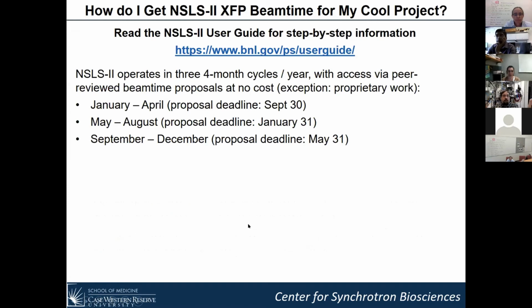I've said a little bit about the beam line. I'm going to say a little bit now about how you get access to beam time at NSLS2. I'm going to hit on some high points, but quite honestly, there's an NSLS2 user guide that's really well written and gives you step-by-step instructions on what to do. I have a link here, but just for reference, NSLS2 operates in 3-4 month cycles per year.